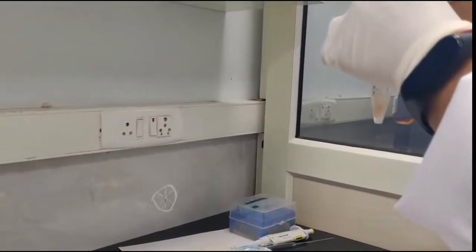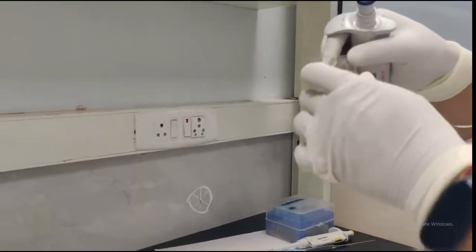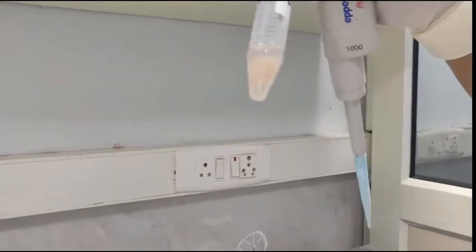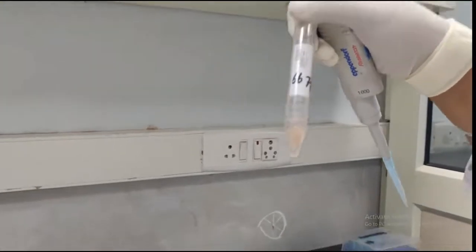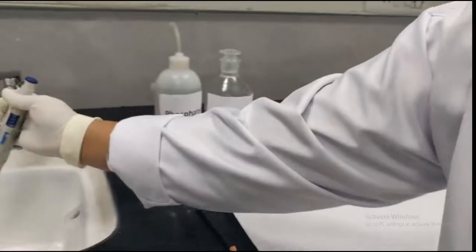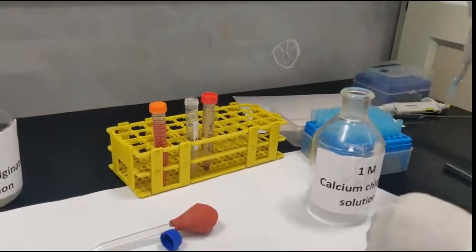sediment within the gel. So within a few seconds, a nice gel forms within the tube. We can see the sediment has been trapped inside this gel. So now the same will be repeated for the second sample. And by the time we are done with the second sample, our gel will be formed.